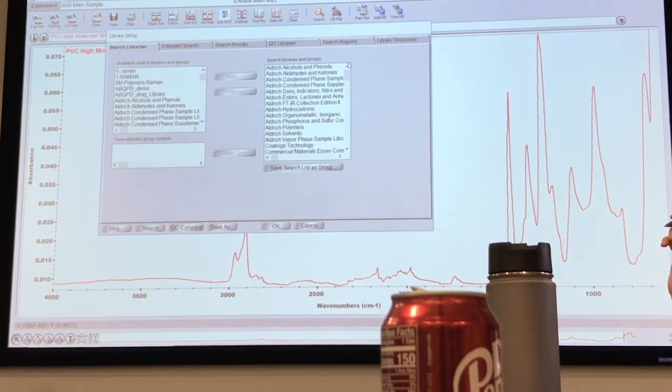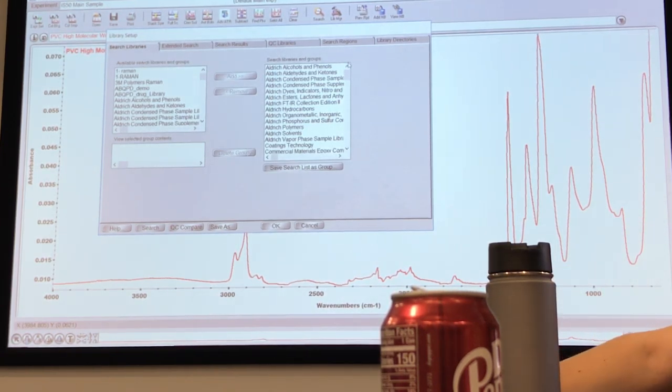And do we have this as well, or is this because this is your account kind of thing? This is what I have. Okay. So, I think the standard that comes is 9,000 spectral libraries. If anybody buys an instrument, they get that, and they add polymer bundles to it as they go along.